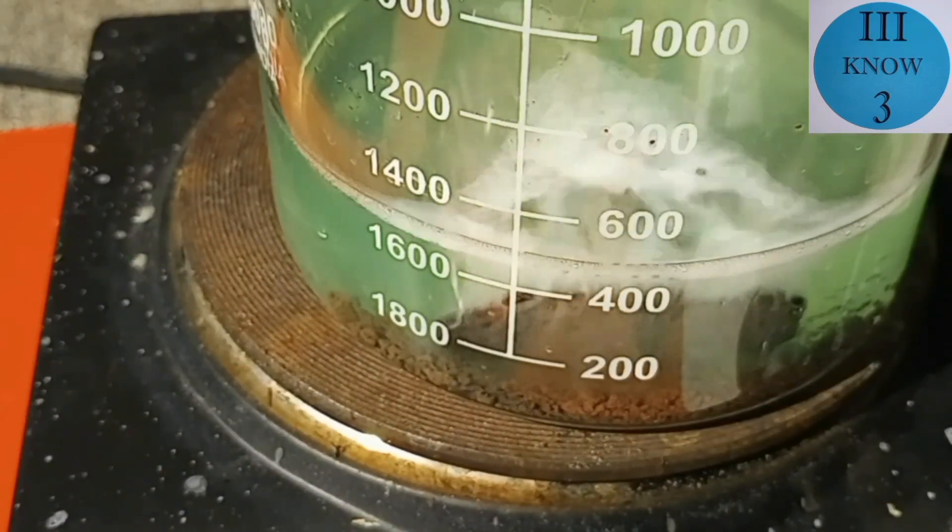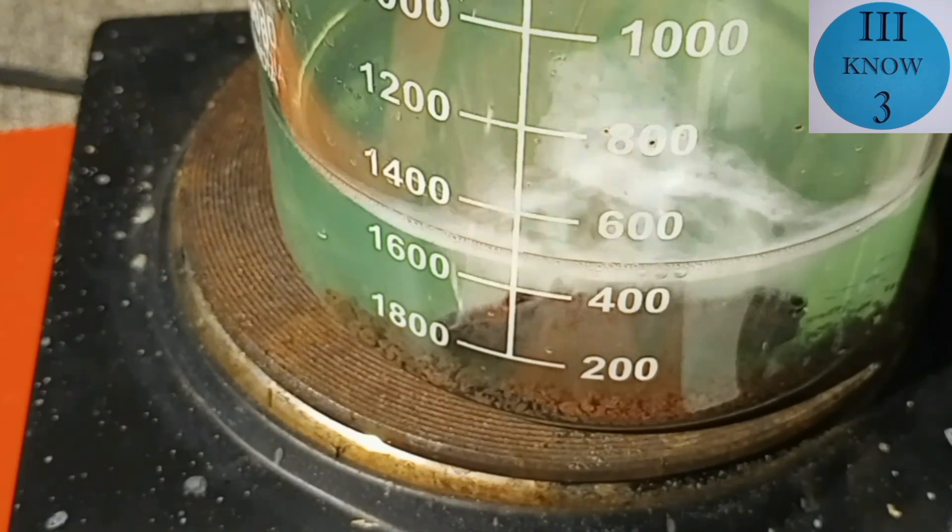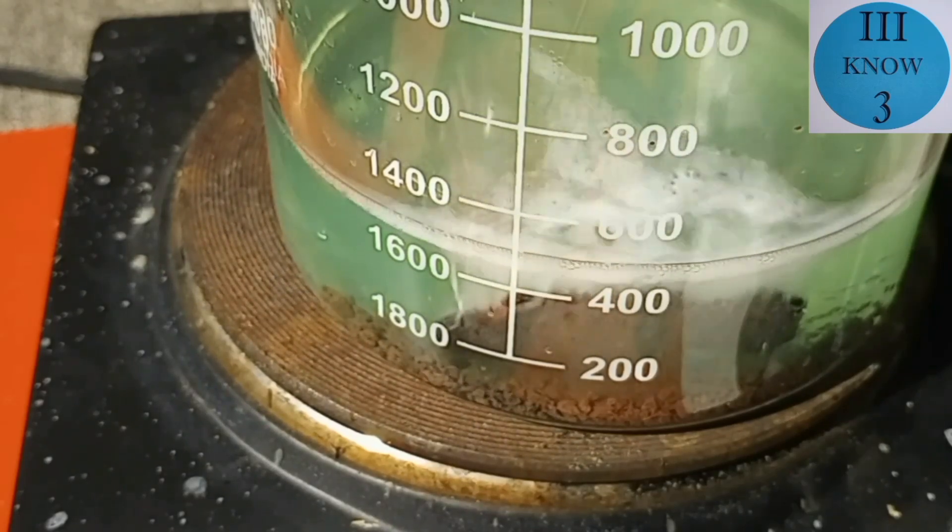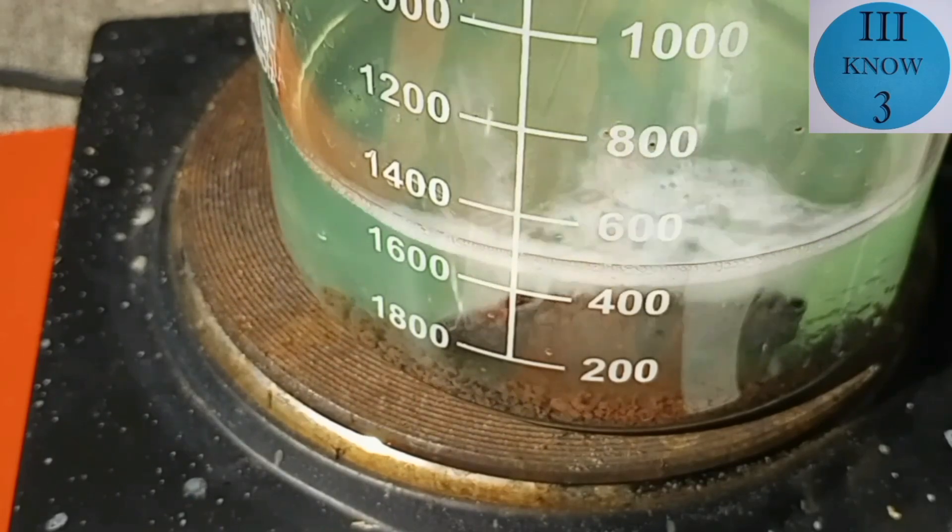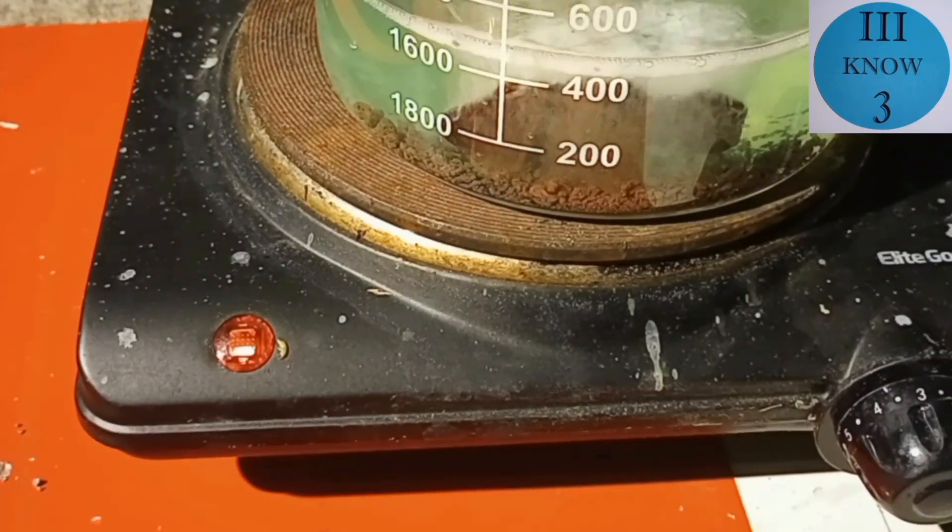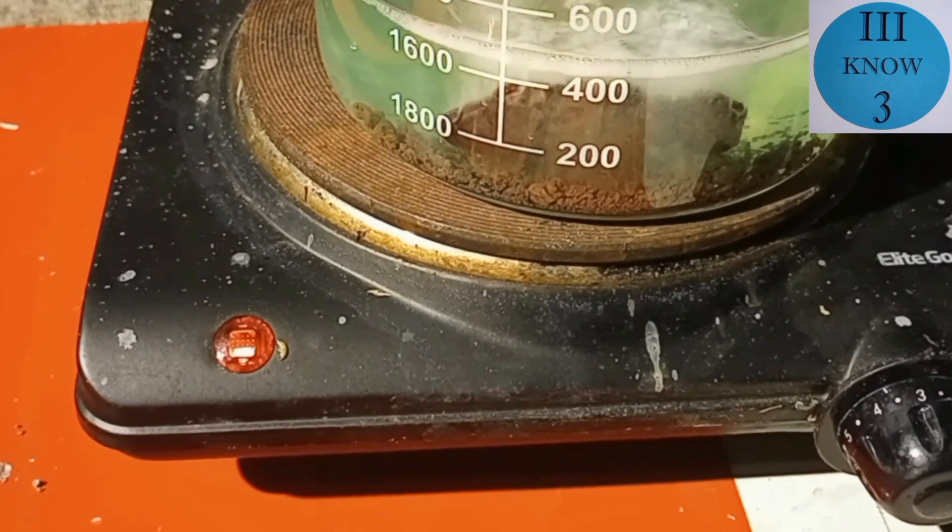Now this is interesting because there's all these little balls of copper. The solution has turned a light green so it looks like nickel acetate and the big piece of zinc is very black.